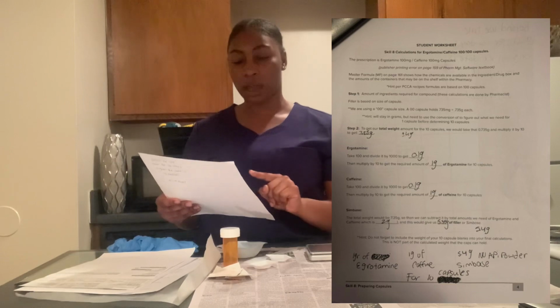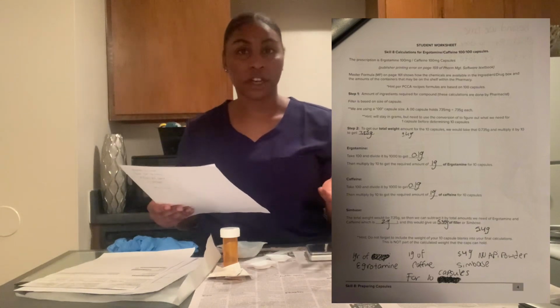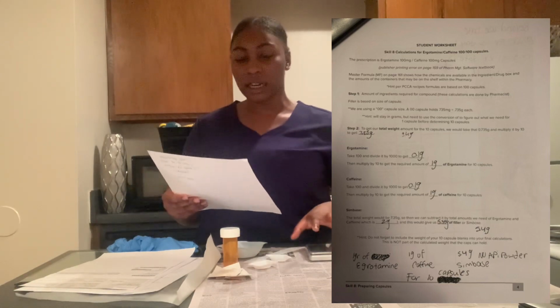So step 1, the amount of ingredients required for this compound. Side note, these calculations are done by a pharmacist, just to put that out there. It says a filler is based on one size capsule.